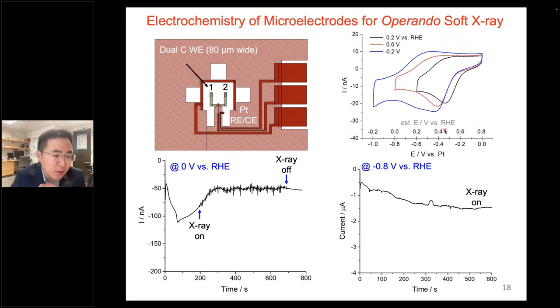This is typically the potential for the reduction of cuprous oxide, and is comparable to what we observed from the liquid cell TEM chip. So electrochemical behavior-wise is comparable. What becomes interesting is that we actually illuminate the entire sample, so the potentiostat can also tell us some information in terms of the beam-sample interaction.